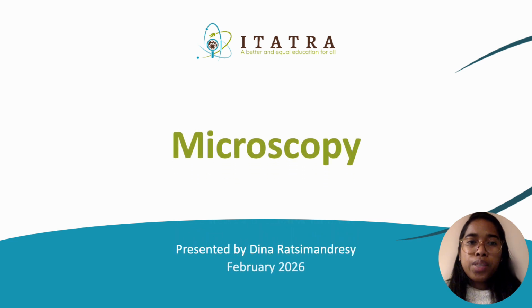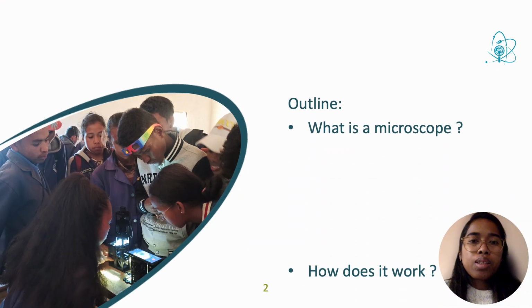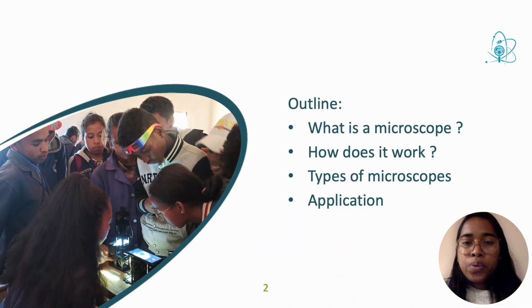In this tutorial, we will now discuss microscopy. The outline of the tutorial is to first define what is a microscope and then explain how it works. We will present a microscope that the student will play with during the activities.